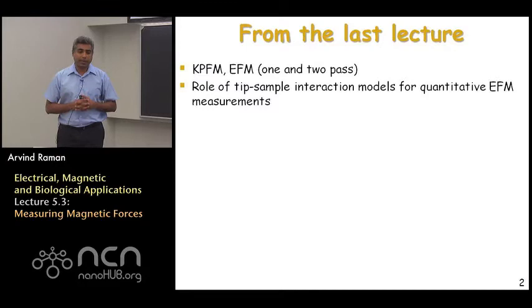Again, this is not going to be a detailed exposition of magnetic force microscopy. It is simply providing an overview from a dynamic AFM method, or the role of dynamic AFM in understanding magnetic force microscopy images. There are a bunch of references at the end in the appendix, and I encourage you to go over them to understand more about the physics of magnetic force microscopy.